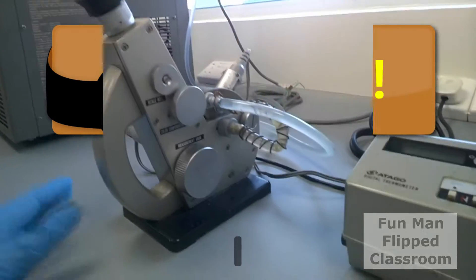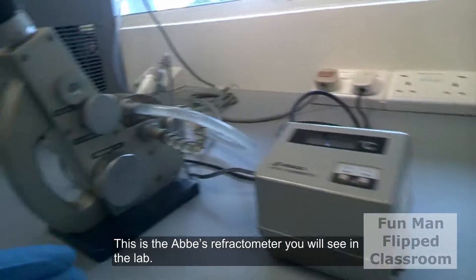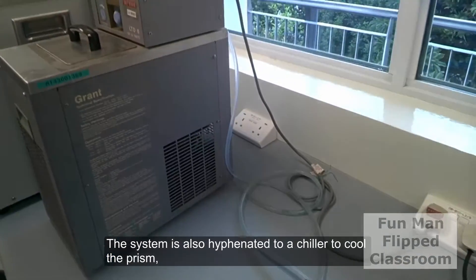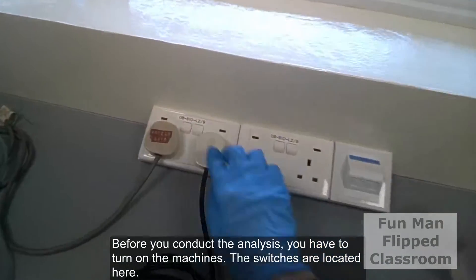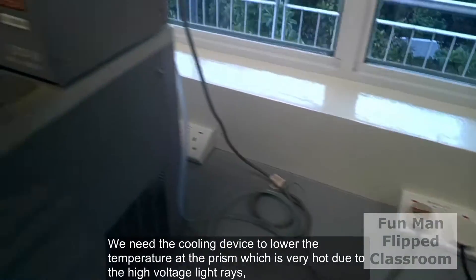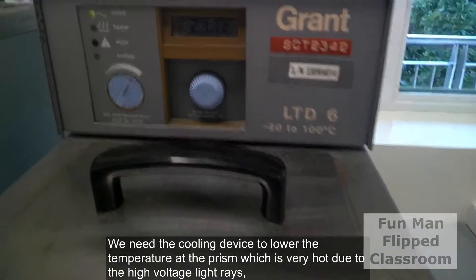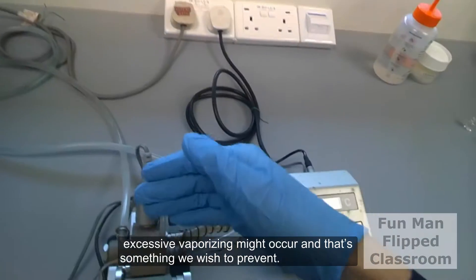This is the Abbe refractometer you will see in the lab. It is joined to a counter, that is a digital thermometer. The system is also hyphenated to a chiller to cool the prism, and before you conduct any analysis, you have to turn on the machines. We need the cooling device to lower the temperature at the prism which is very hot due to the high voltage light rays. Excessive vaporization might occur and this is something we wish to prevent.